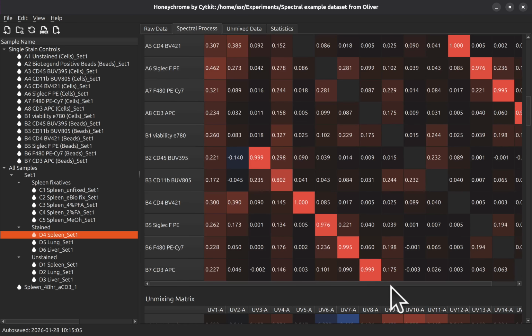So see this one, these two are the same. If I hold down Control, select two at once, you see that they have the same name, have pretty much the same profile, and are identical.